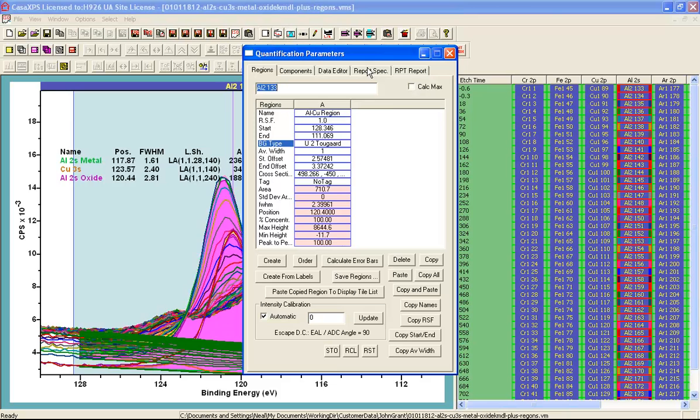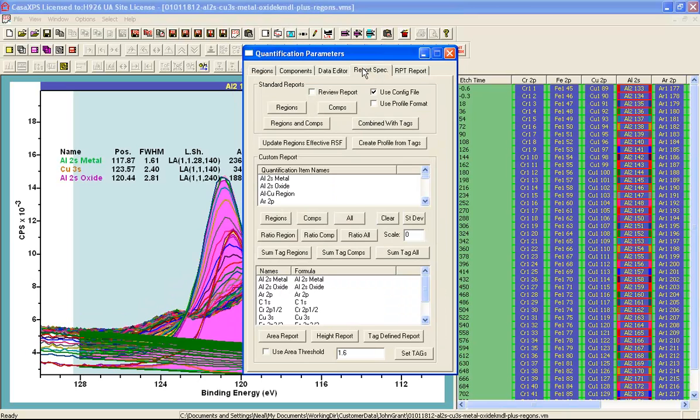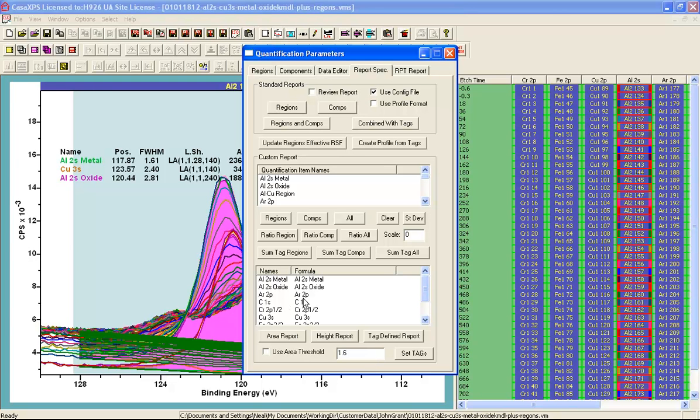What I will need to do is use the quantification parameters dialog window and the report spec property page using the custom report to create a depth profile. The depth profile will gather information from each of the selected VAMAS blocks in the right hand side.